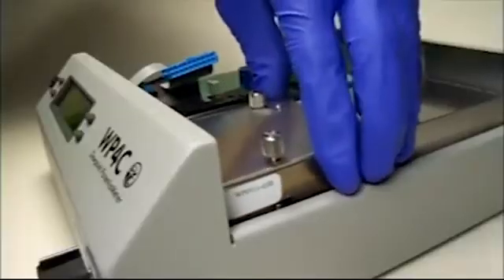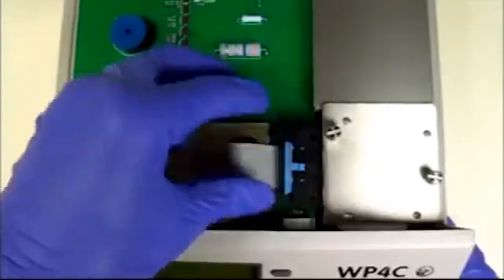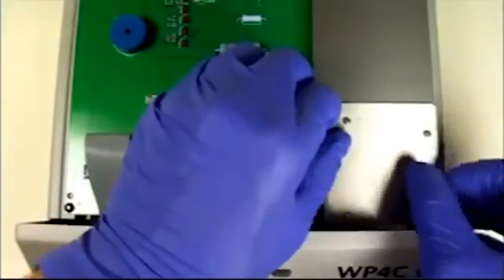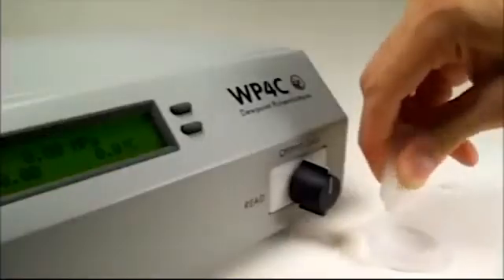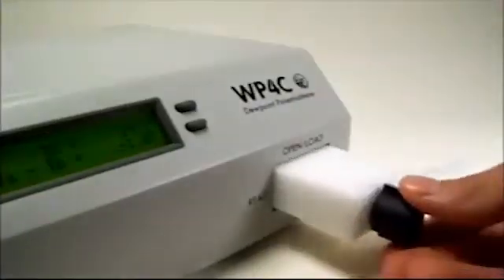Now replace the block, plug in the ribbon cable, and secure the locking levers. Tighten the thumbscrews with your fingers until they're snug. Replace the lid and reconnect the power cord. After cleaning, check the calibration again with your liquid standard.